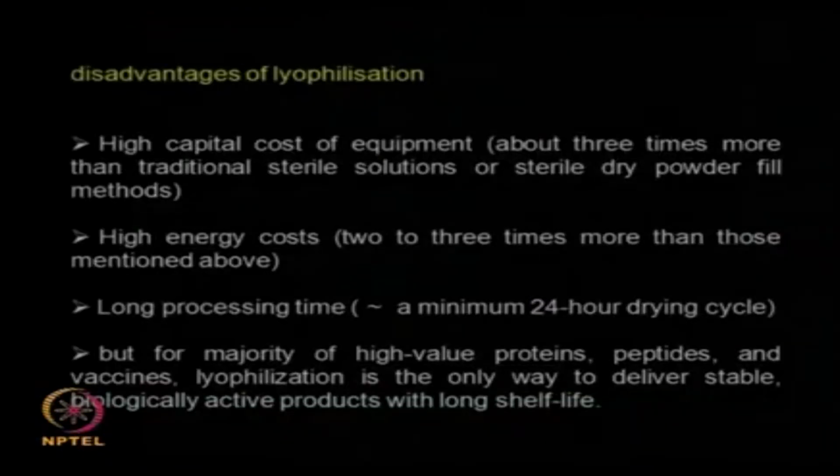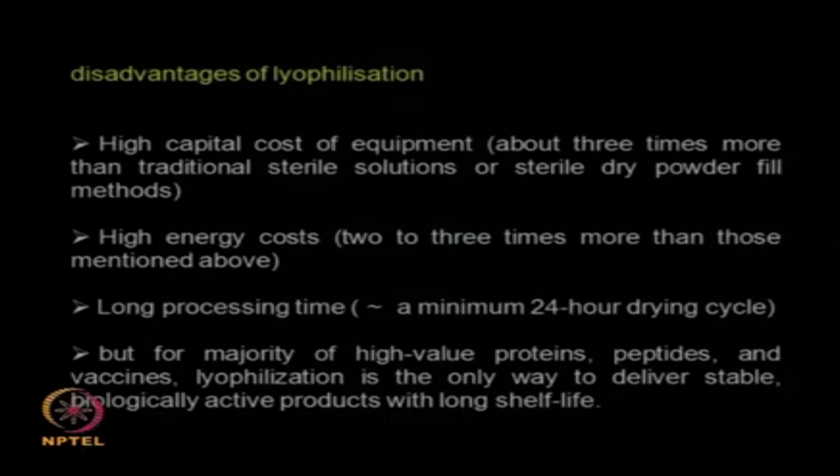So what are the disadvantages of lyophilization? It is pretty expensive, the capital cost of the equipment is very high, it is 3 times more than traditional sterile solutions or sterile dry powder fill methods, because you need a refrigeration system, you need a vacuum pump, so many things. High energy cost, 2 to 3 times. Long processing time.